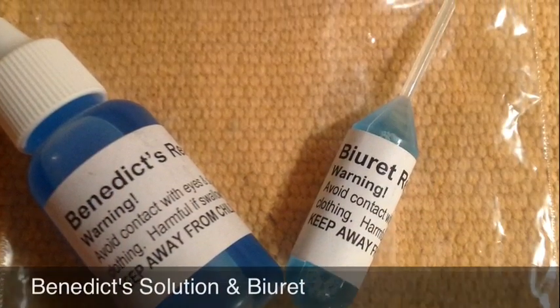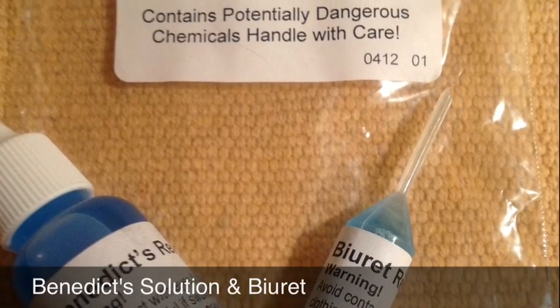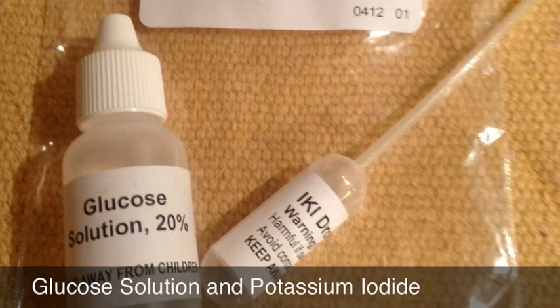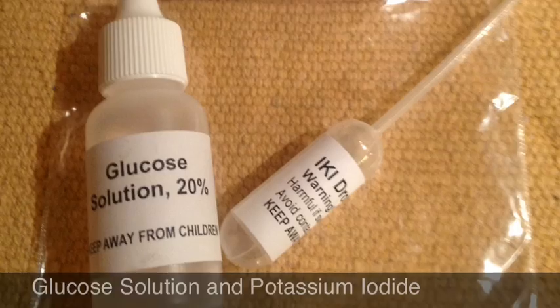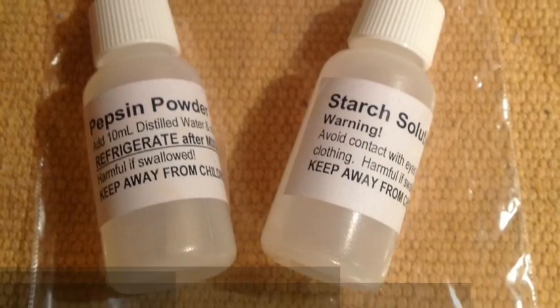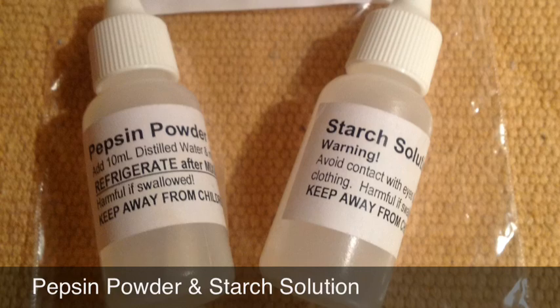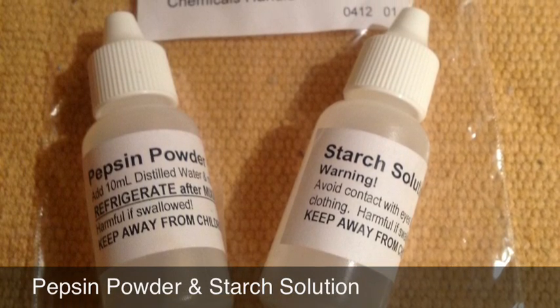The Benedict solution and the small pipette containing Biuret. The bottle of glucose solution and the pipette marked for potassium iodide. Find the bottle marked pepsin powder — you'll add distilled water to this during the experiment. You'll also need the bottle of starch solution.